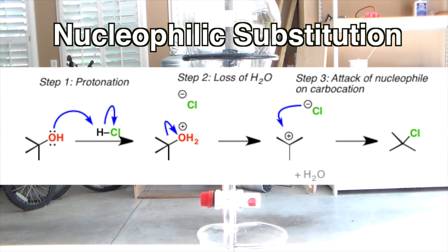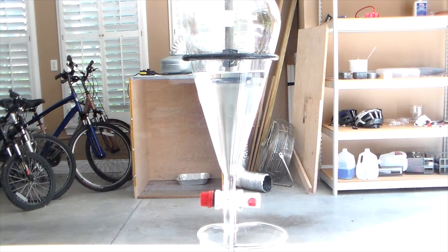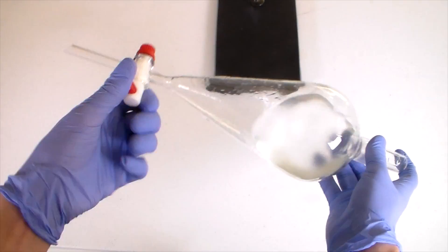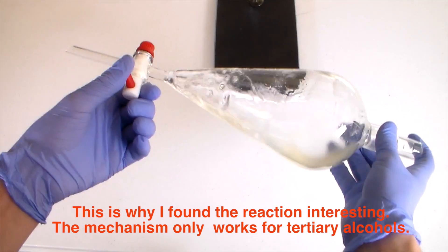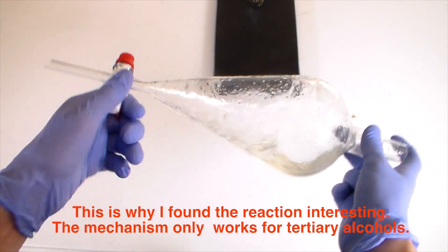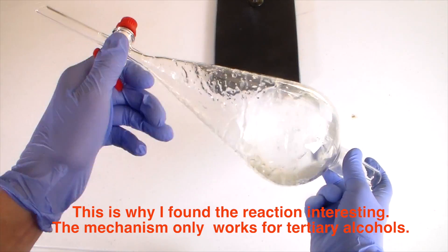The carbocation is easily attacked by the negative chloride ion, forming a carbon-chlorine bond and producing our tert-butyl chloride product. The specific reaction mechanism is called SN1. Again, I'm not going to fully explain SN1 reactions in detail, but what's important here is that SN1 mechanisms only really work for tertiary alcohols. This is because the carbocation of tertiary alcohols is much more stable than those of primary and secondary alcohols.